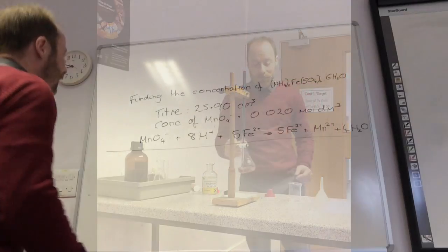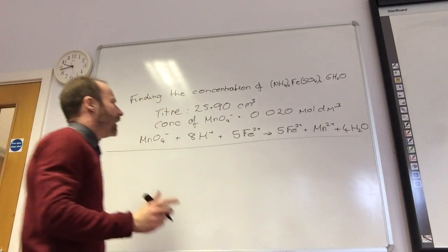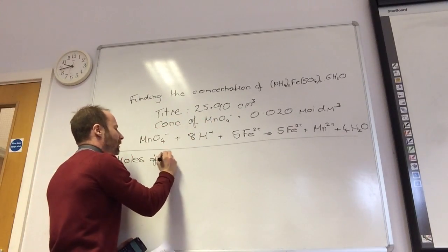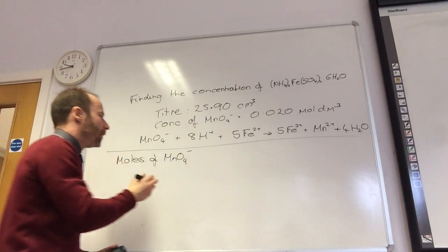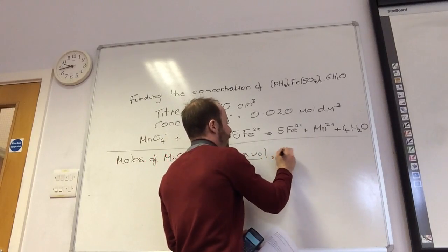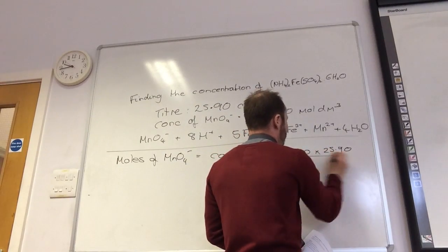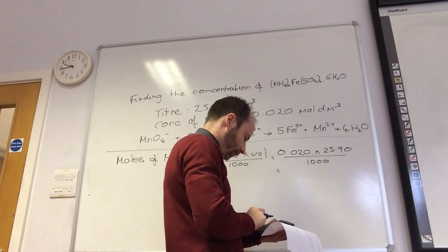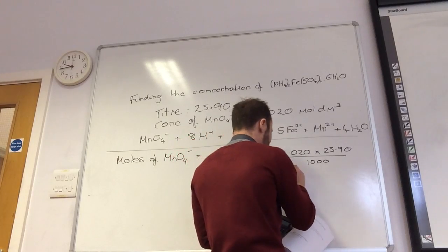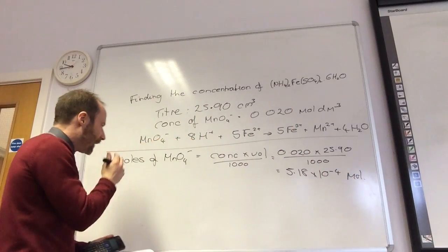Okay, cool. So we're now going to use our titre to work out the concentration of this guy here. So I have got a volume and I've got a concentration, so what can I work out? Moles of MnO4- is going to be concentration times volume over 1,000. So that's 0.020 times my volume, 25.90 over 1,000. And that gives me 5.18 times 10 to the minus 4 moles. What do I need to relate that to now?